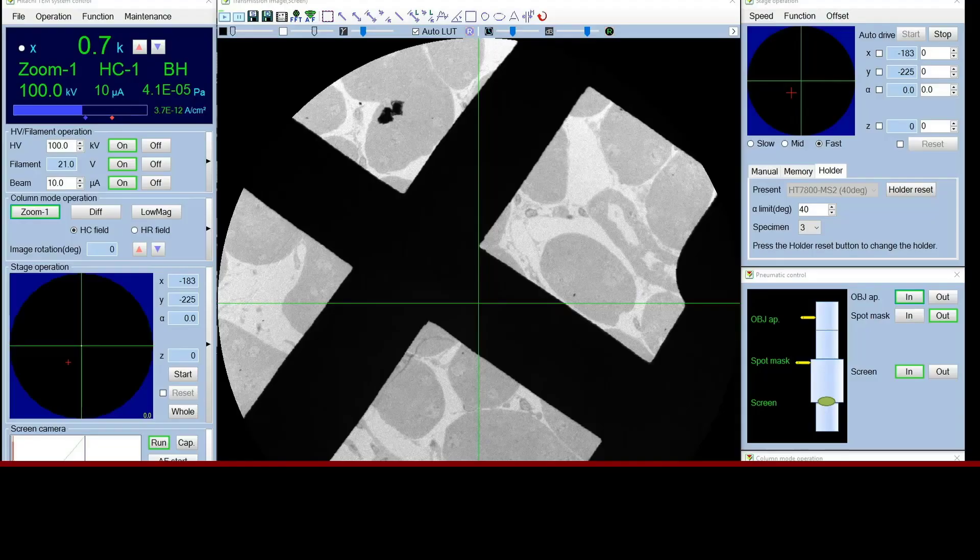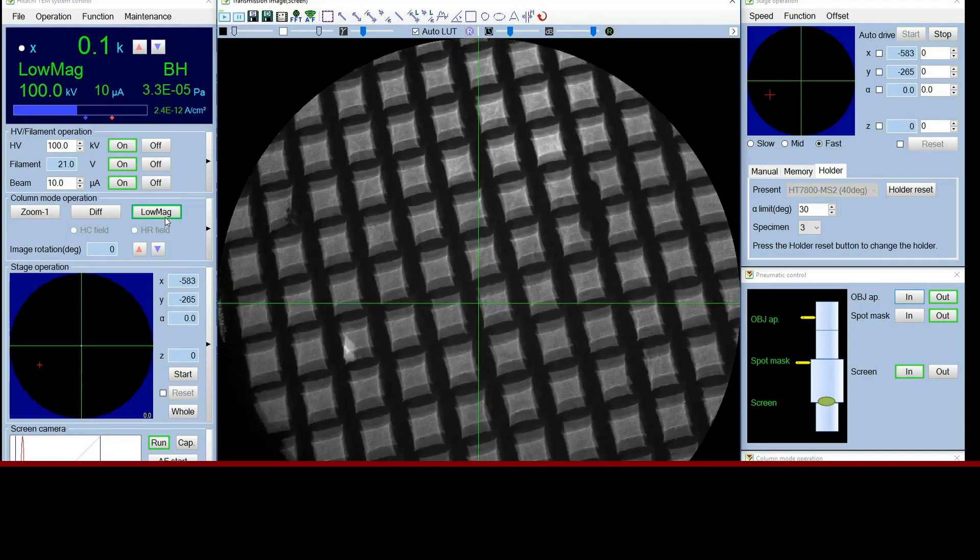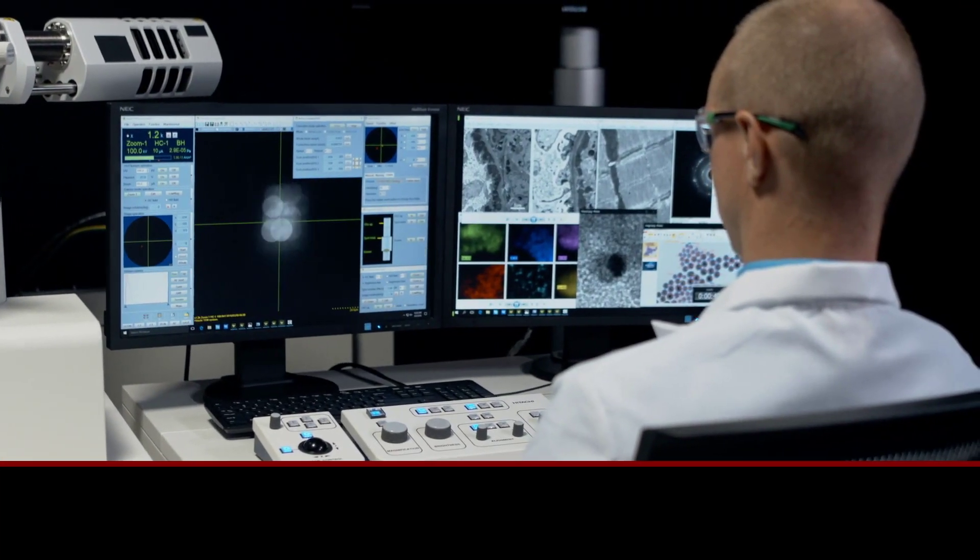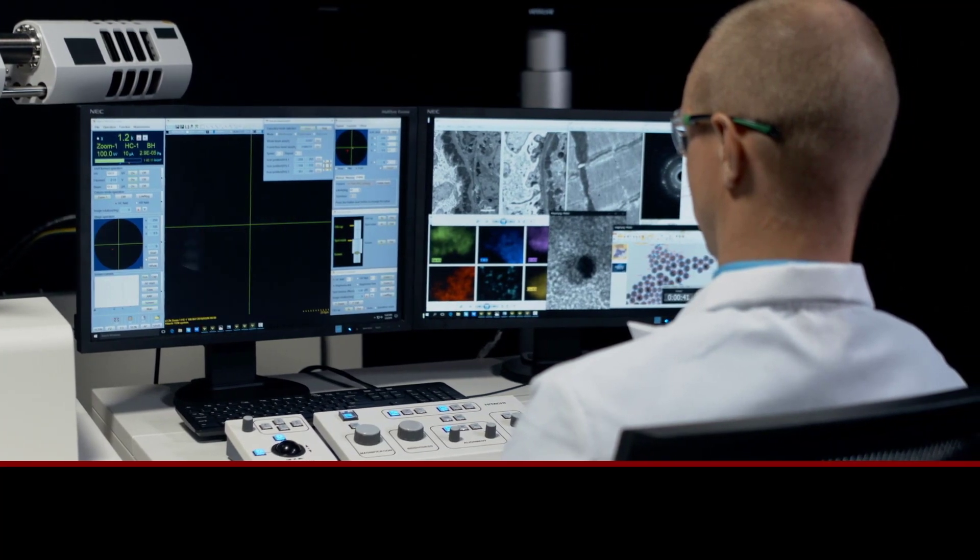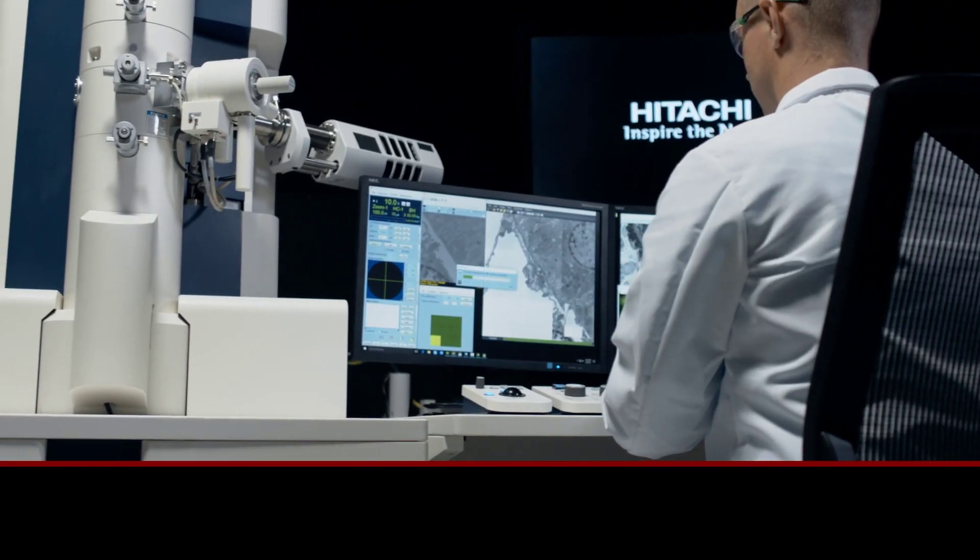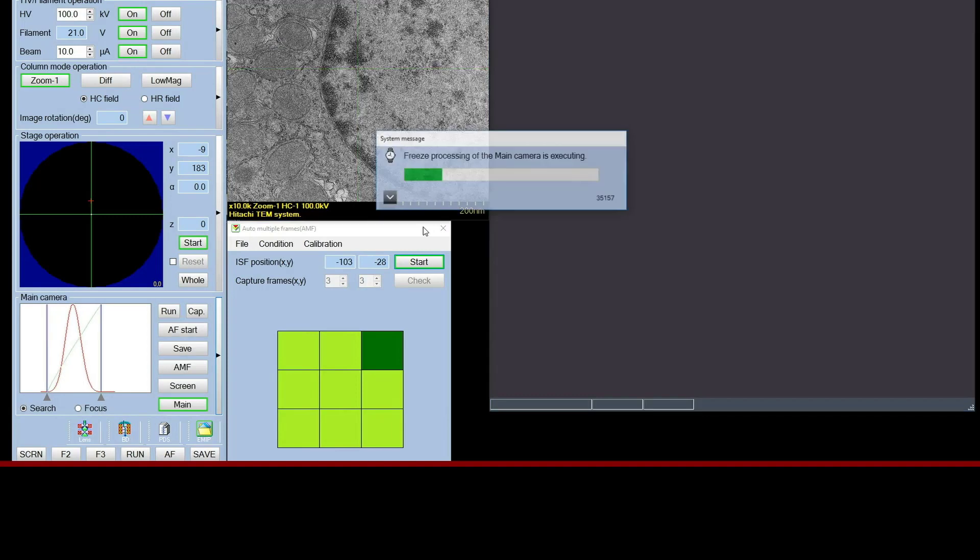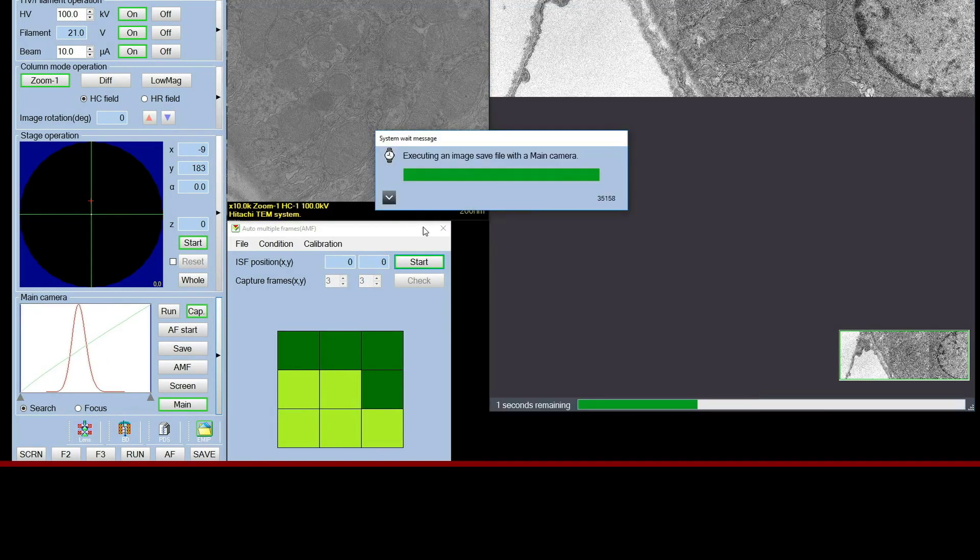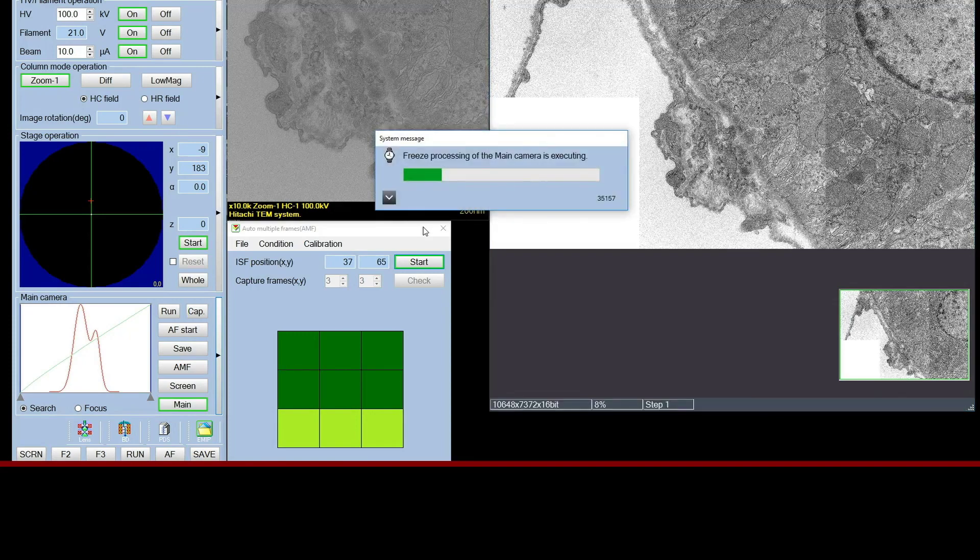An automated objective aperture provides seamless transition across magnification ranges. Utilizing Hitachi's cutting-edge technology and software, the HT7800 provides unrivaled ease of use and automation. Features including automated pre-radiation, auto-focus, automated montage, and whole grid-view navigation make imaging a breeze.